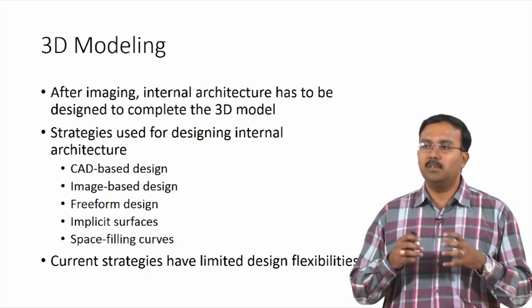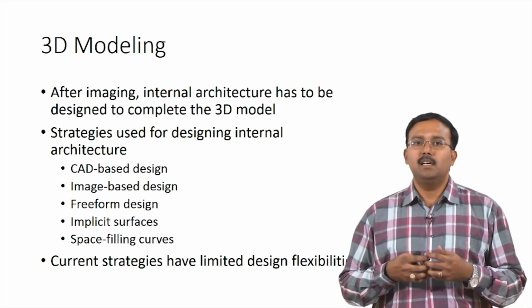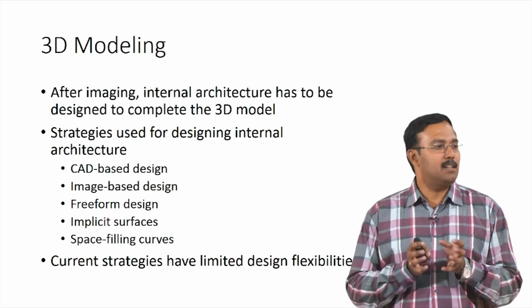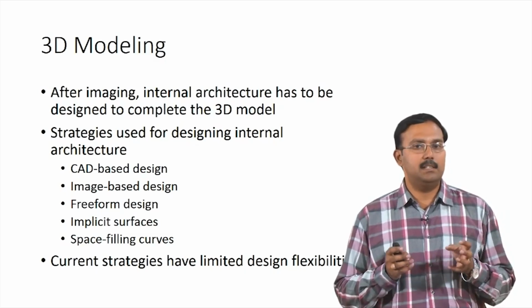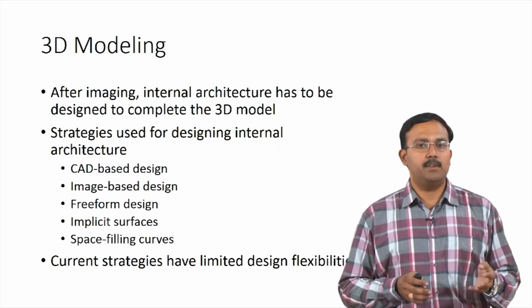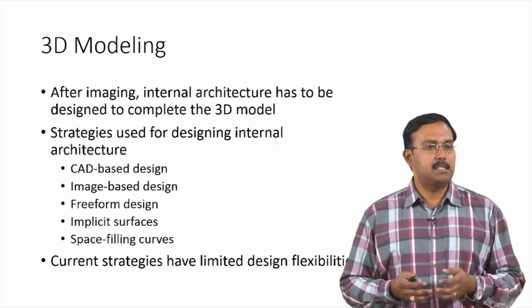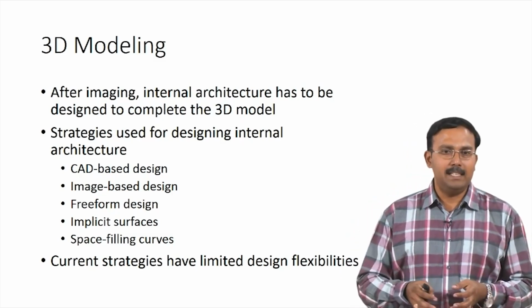So you would still have to fill the voids using the architecture, for which building the 3D model is done through different approaches. Some of the strategies which are used in designing the internal architecture are CAD based designs, image based designs, free-form design using implicit surfaces and space filling curves.